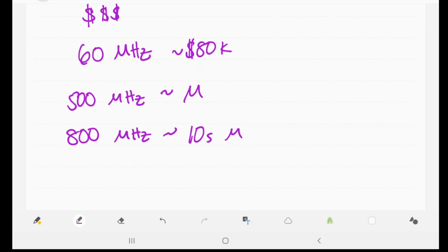Not very good, but the more you see that you can just keep acquiring more and more spectra, and the more you do, you can add them all together and get that. So suffice it to say, these are tens of millions of dollars. These are not instruments that we have handily at the college. We would have to go over to the base to look at their machines and all that. I'm not really worried about the machines, though. You can read about them. You can look at them.